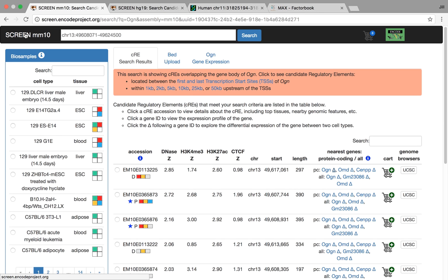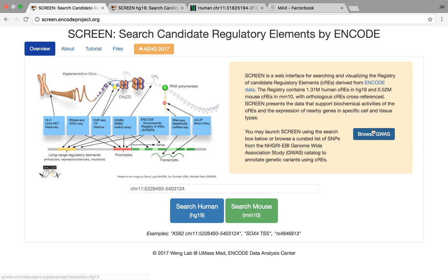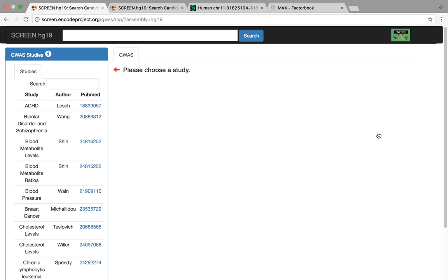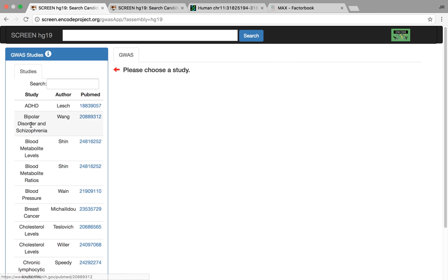And one last thing, a GWAS visualizer. So if you're interested in SNPs, the natural question to ask would be, what CREs overlap with my SNPs of interest? And Jill's been working on this for quite some time, where we have a wide range of studies. You can go to the PubMed link for more information.